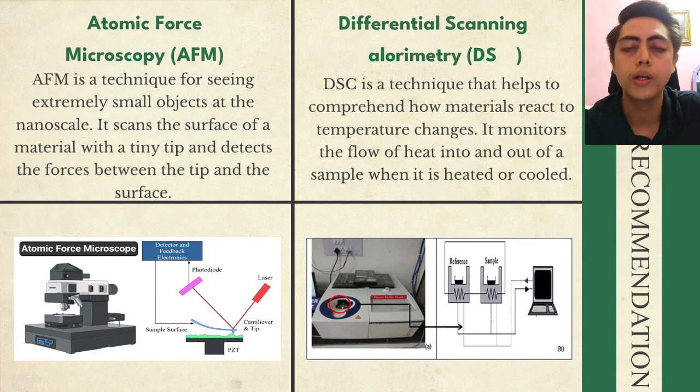It is used to analyze microscopic structures and comprehend surface features at very small scales in domains including material science, nanotechnology, and biology. Next technique is DSC.